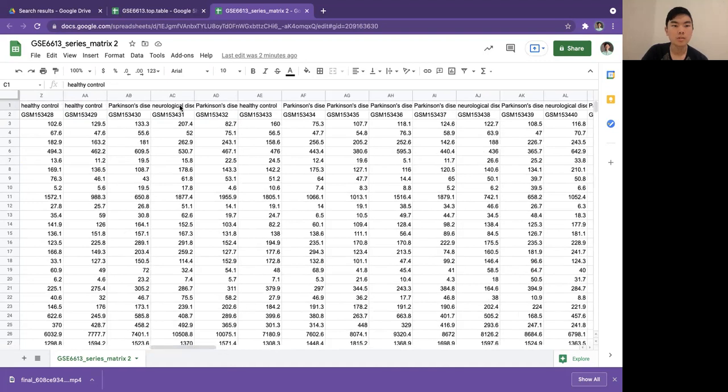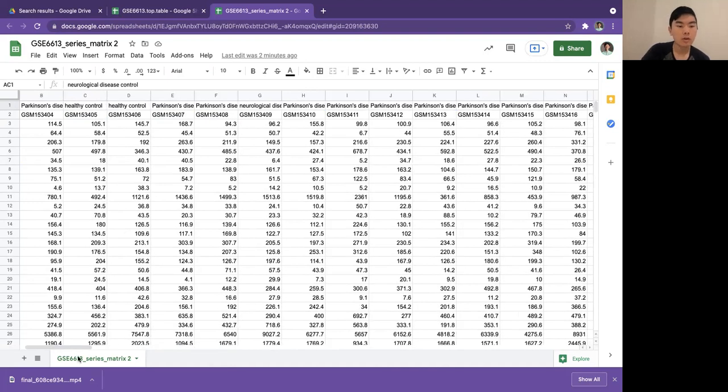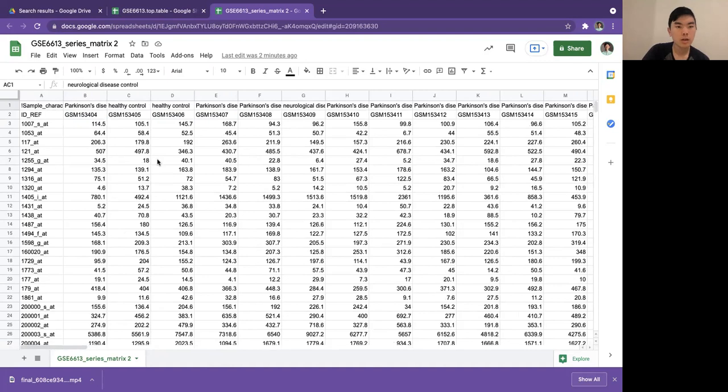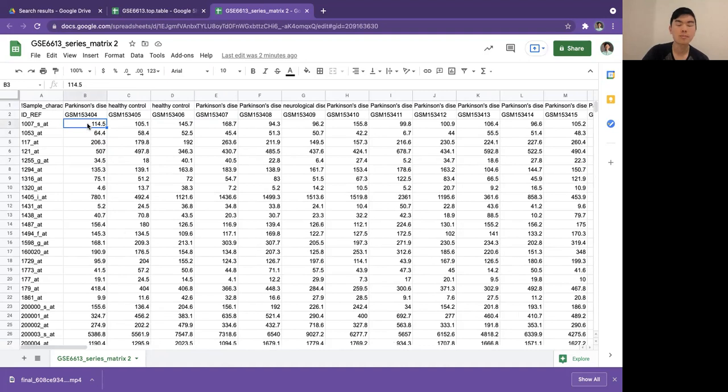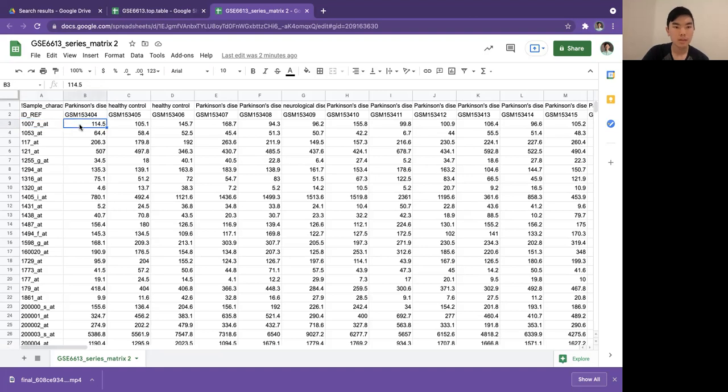In each little actual numerical number, that is the signal, the expression intensity or signal intensity for that patient for this gene. If you remember, microarrays can't actually precisely determine the amount of RNA or mRNA that there is.